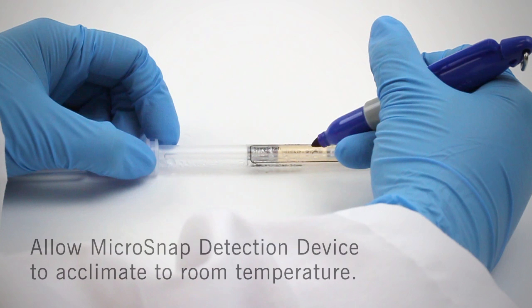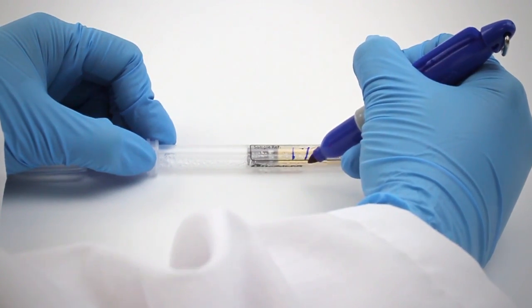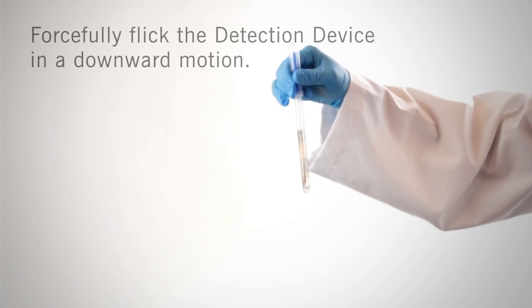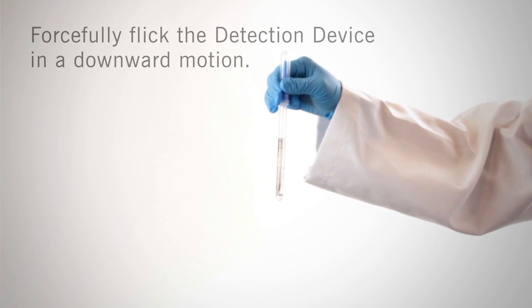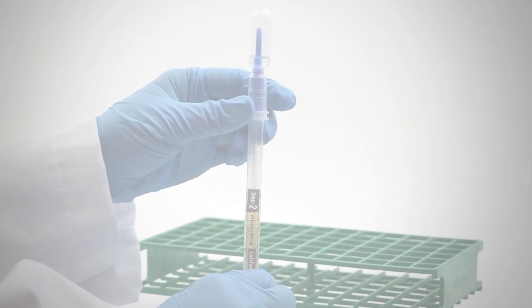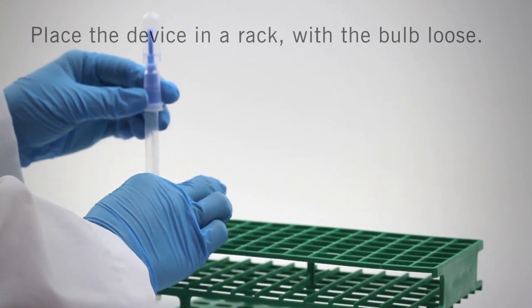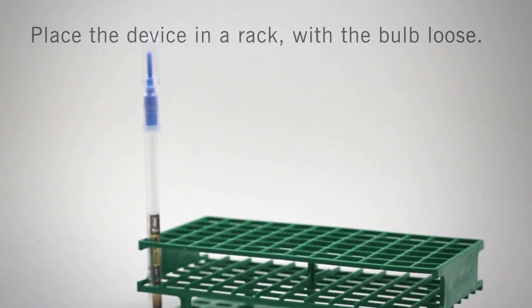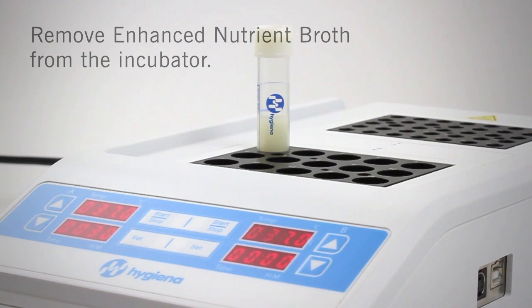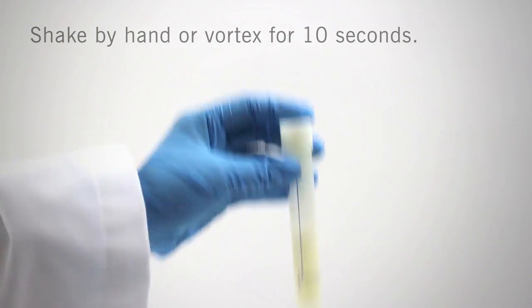The second step is detection. Allow the coliform detection device to acclimate to room temperature before testing begins. Write the location or product ID on the tube label for easy identification. Holding the tube upright, forcefully flick the detection device in a downward motion to bring droplets of chemistry to the bottom of the tube. Open the detection device by twisting and pulling to remove the bulb, and place the device in a rack with the bulb loose. Remove the Enhanced Nutrient Broth vial from the incubator and mix by hand-shaking or vortexing for 10 seconds to disperse the sample.